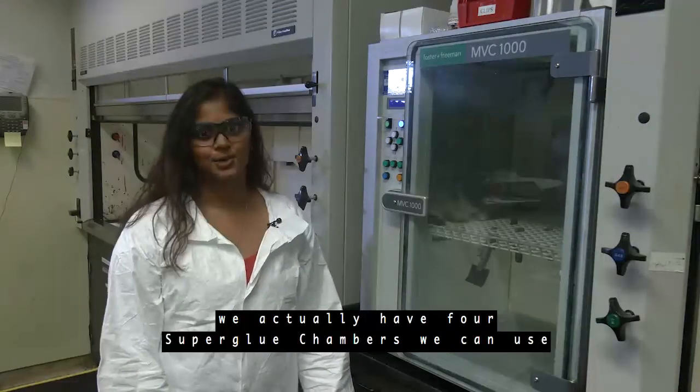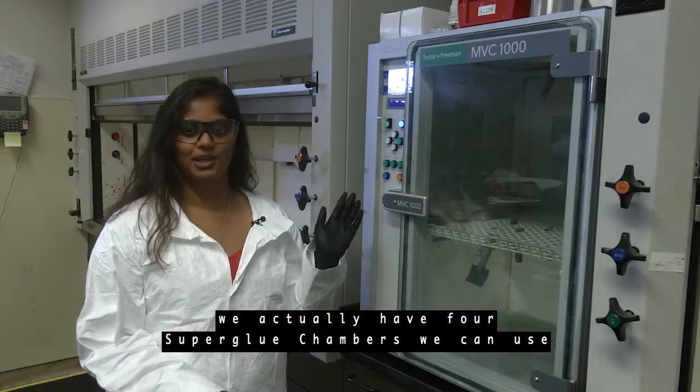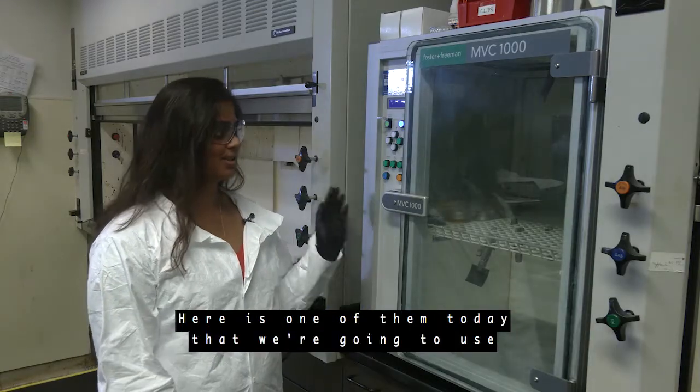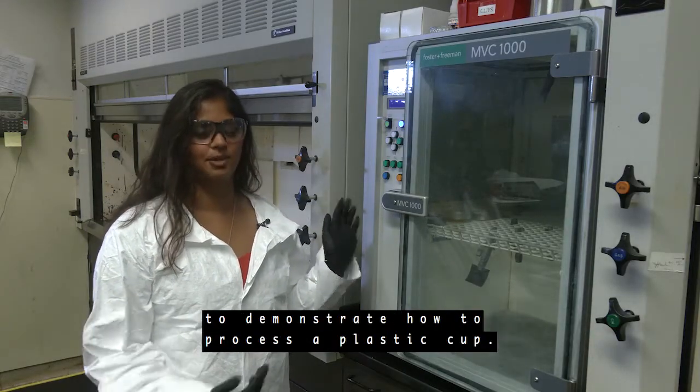Here at the Fingerprints Operations Branch we actually have four superglue chambers we can use when processing evidence. Here's one of them today that we're going to use to demonstrate how to process a plastic cup.